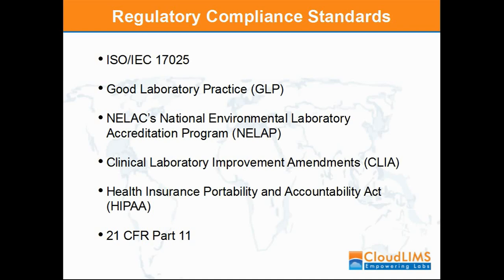Most labs follow the ISO 17025 regulations. ISO 17025 is the main ISO standard used by testing and calibration labs. It covers testing and calibration performed using standard methods, non-standard methods, and lab-developed methods. In most countries, ISO 17025 is the standard for which most labs must hold accreditation in order to be deemed technically competent.